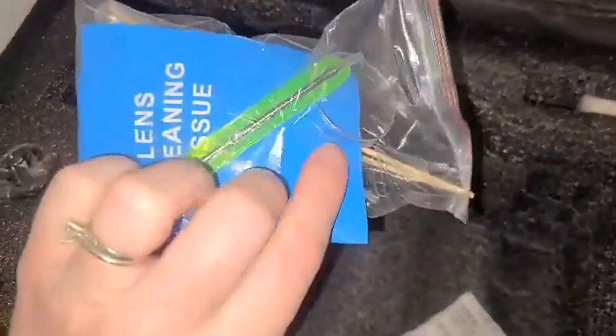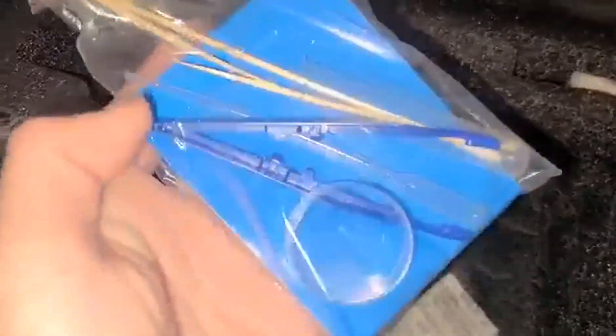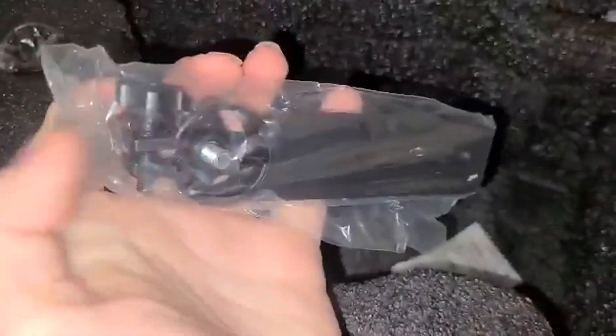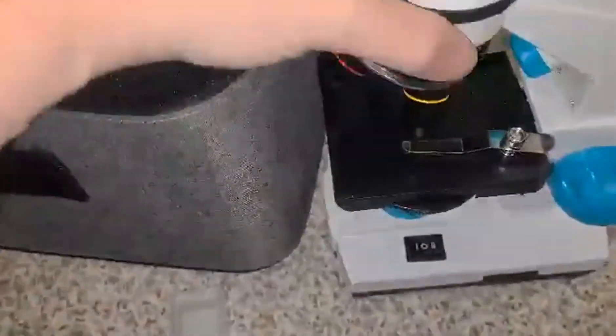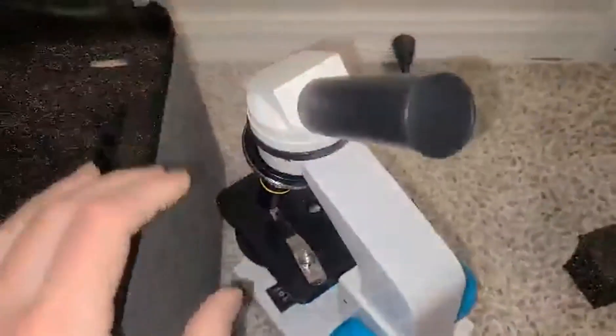Then you've got your accessories here as well — some tweezers and lens cleaning tissue, a little dropper. You can also hook a phone onto this to take pics and video, which is very cool.